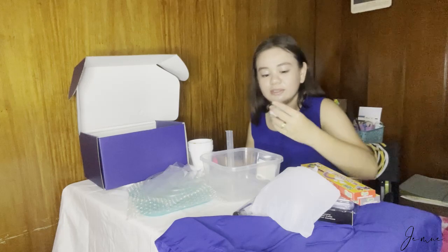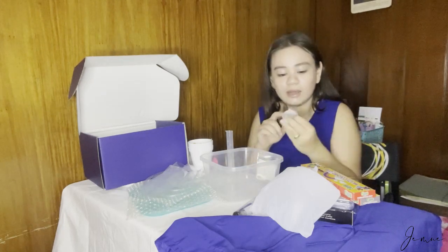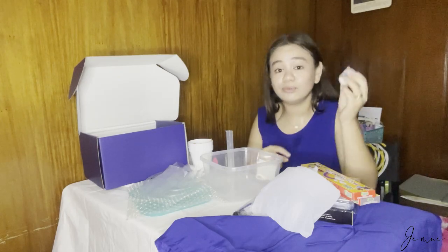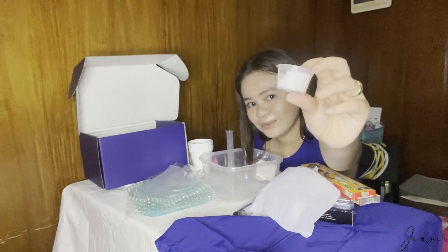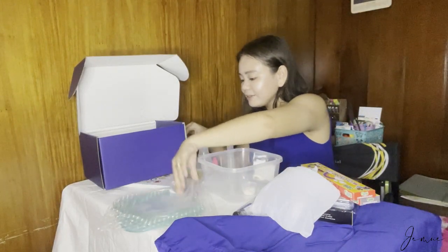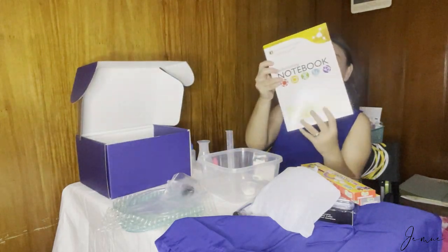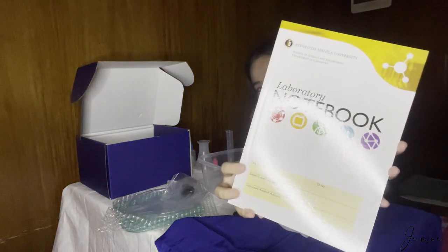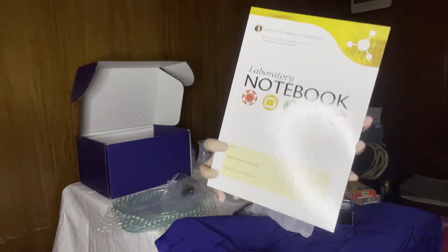Last but not the least, I don't know kung ano yung laman nito kasi hindi nila sinabi — unknown for experiment. This is what we have. And guys, pinadalakan din pala nila kami ng laboratory notebook — kasama siya sa box nung pinadala. It's super duper cute.